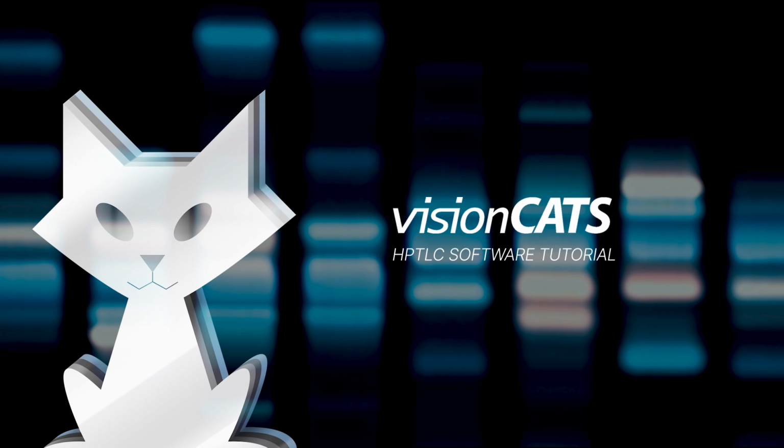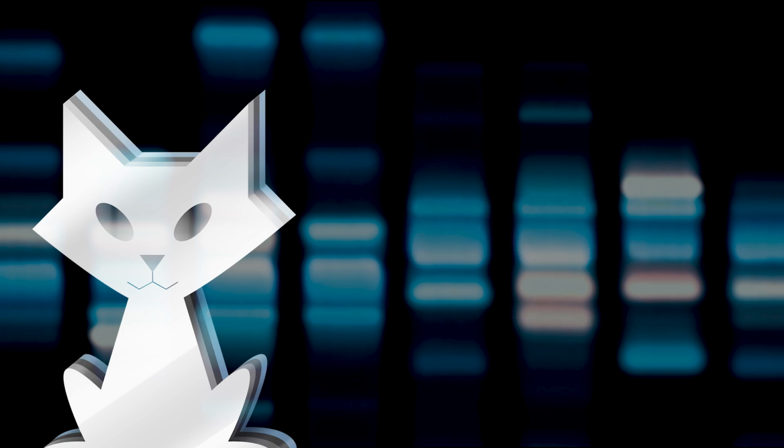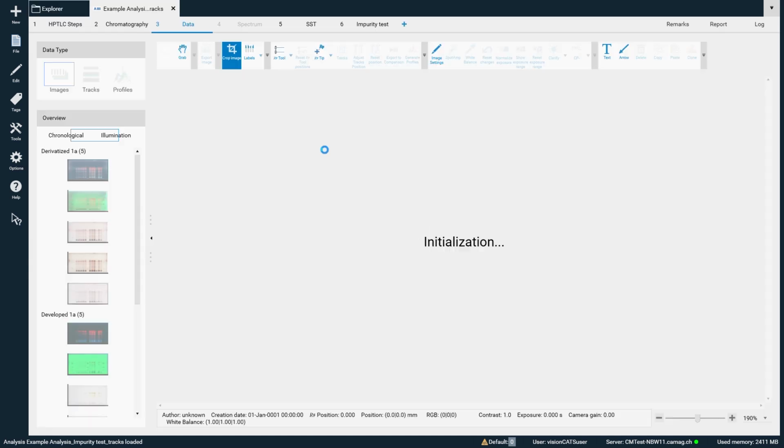Welcome! In this tutorial, you'll learn how to perform an impurity test on image tracks in visionCATS, allowing you to efficiently identify and evaluate deviations within your chromatogram. Start by opening the analysis file.